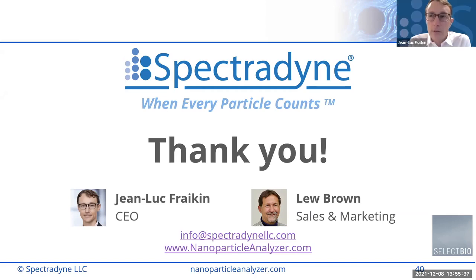That's a good question. So we measure the transit time for each particle, right? And I know this is something that you've been talking to our support team about, right? And we're trying to help you out. The transit time of the particles is what we use with a calibration factor to calculate the measured volume of the sample that was measured. And then it's pretty straightforward.